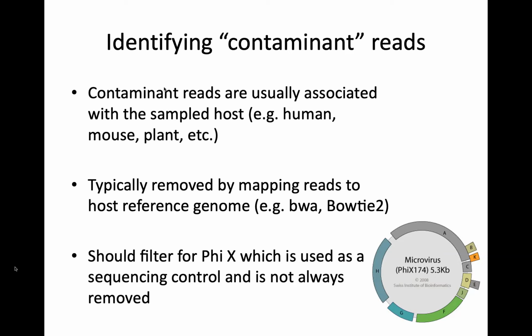Just to be clear, you need to do 16S sequencing on top of the metagenomics? No, no, definitely not. So typically, most people doing metagenomic sequencing will just do the metagenomics. Now, a lot of people will do 16S sequencing first because it's cheaper, and then they'll do all their samples, and then they might follow that up with some metagenomic sequencing after. But it's thought pretty much on the whole that metagenomics does a better job than 16S because of the things I mentioned before, the primer biases, better resolution, things like that.